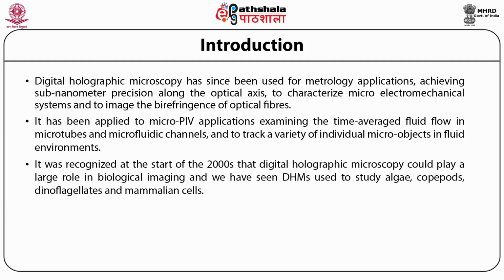It was recognized at the start of the 2000s that digital holographic microscopy could play a large role in biological imaging, and we have seen DHM used to study algae, copepods, dinoflagellates, and mammalian cells.